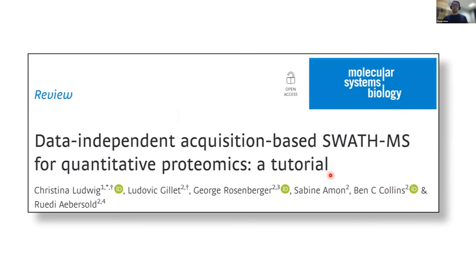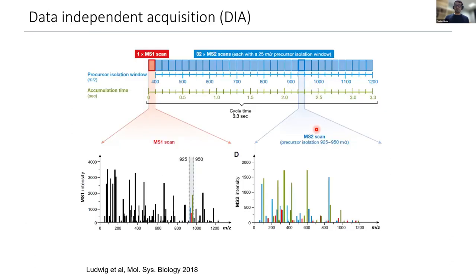If you really want to learn more about DIA, I can highly recommend this tutorial review, which is beautifully written, beautifully illustrated, and contains everything you need to know to get started with DIA. Because I like it so much, I also took a few figures from that paper that I would like to explain in the next five to 10 minutes or so. But if you need more details, feel free to go back to this tutorial.